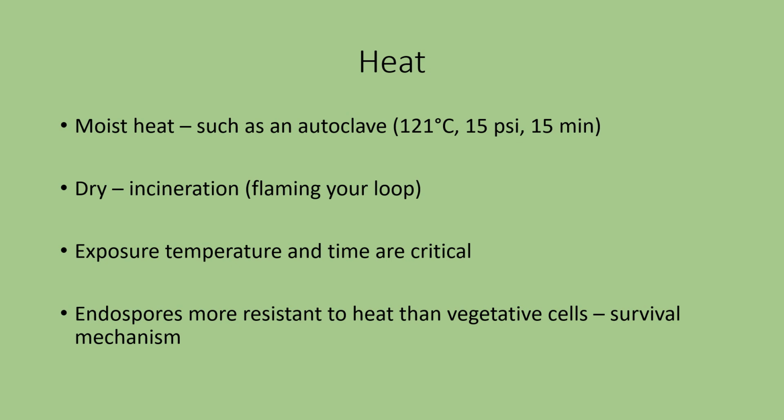So we would take it out of the autoclave and keep it closed. We usually worked with containers that had aluminum foil over them, so we would not open the containers and expose them to the regular air in the room. We kept everything sealed. And then 24 hours later, we would run it through the autoclave a second time.